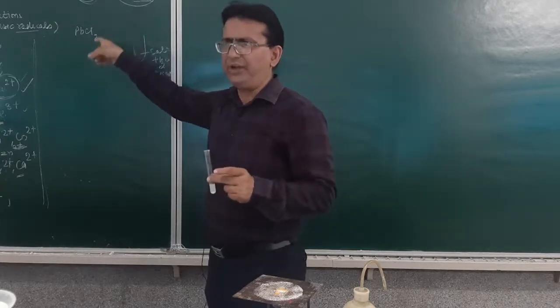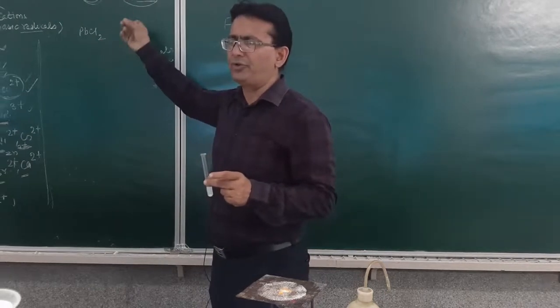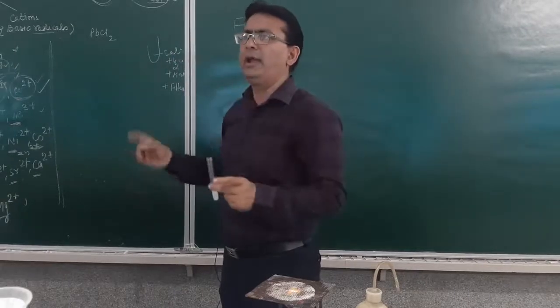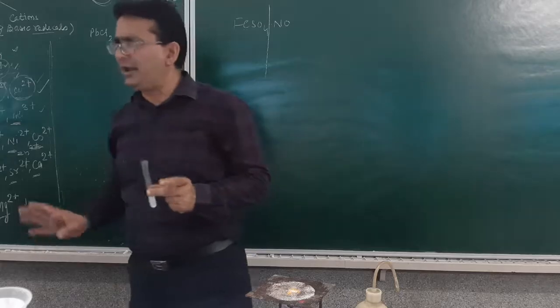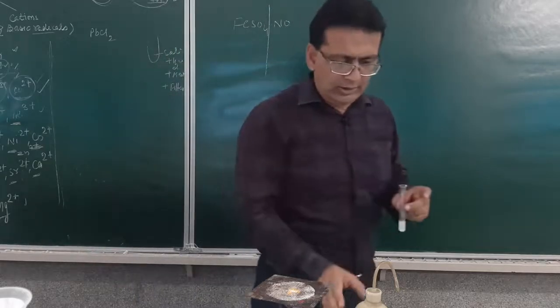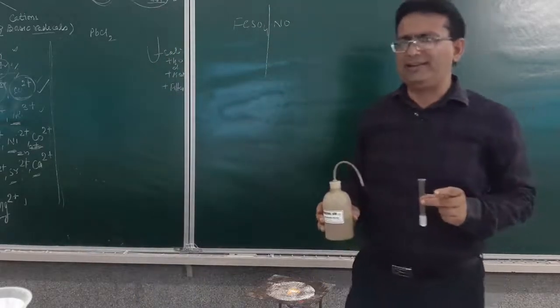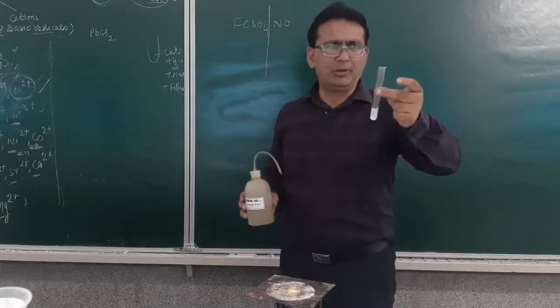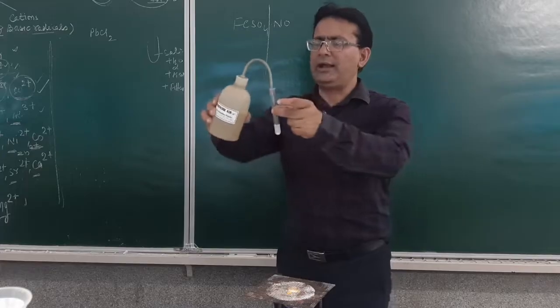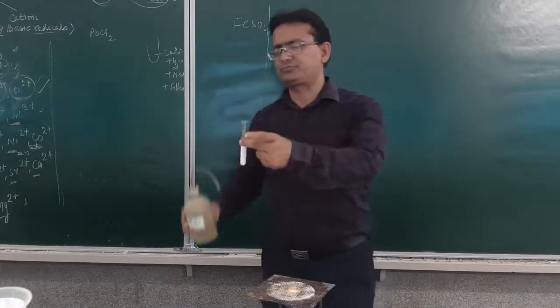In the study material provided to you, it is given: if it is not soluble, as it is not soluble over here, add dilute HCl. If it is still not soluble, add hot and concentrated HCl, then nitric acid. But in the first group, the group reagent is dilute HCl. So we have taken the salt, prepared its solution, and then added dilute HCl into this.